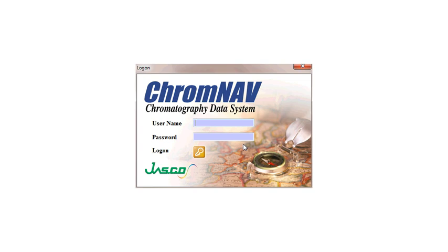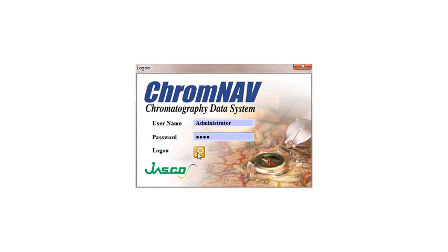The very first time you log into the software, your username will be Administrator with a capital A, and your password root, R-O-O-T, all lowercase. After you have typed those in, please click the login key.